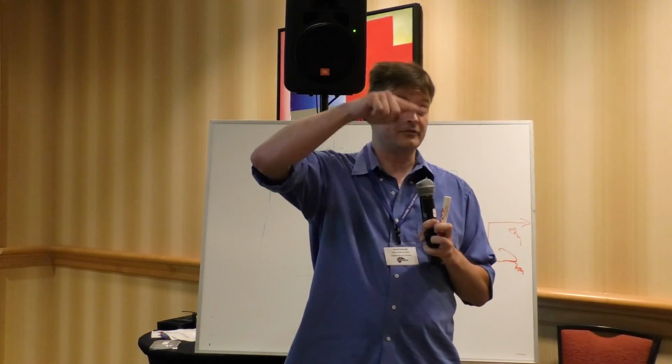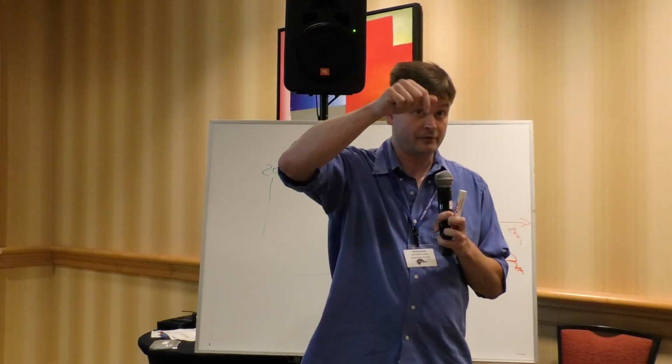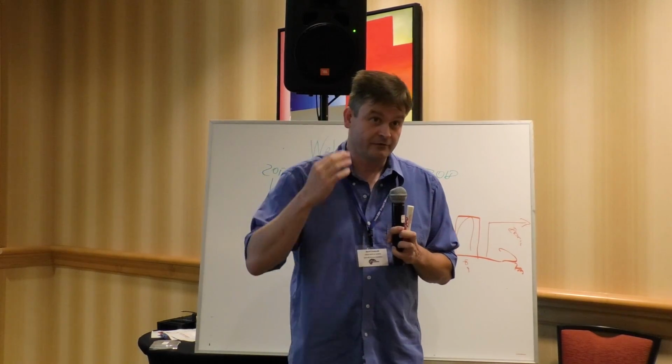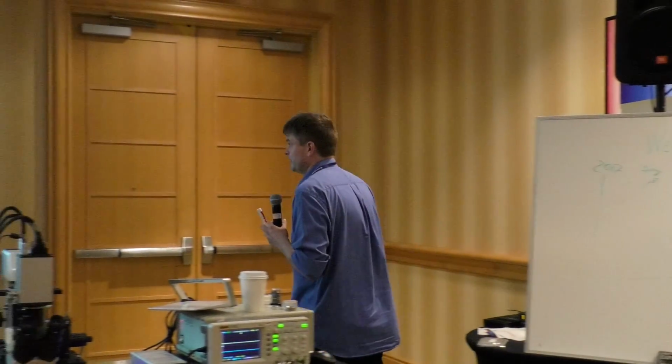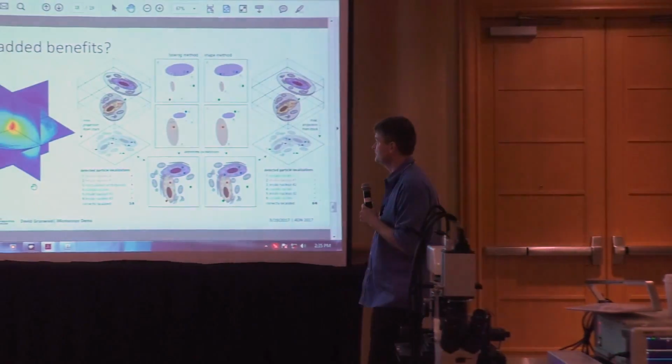Yeah? And then you start coding, or you find somebody who coded something. You look for the right plane and say, oh, this is the brightest one, so I take this as a one, and then try not to use the off-focus signal. Well, why don't we use the off-focus signal? Why don't we do 3D fits? Yeah? This is all possible. It's pretty possible. You can do it with all sorts of probability estimates again.